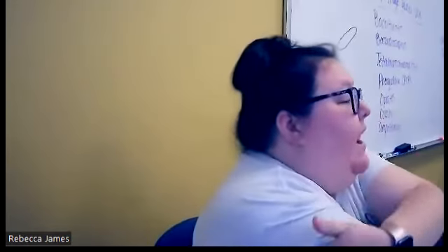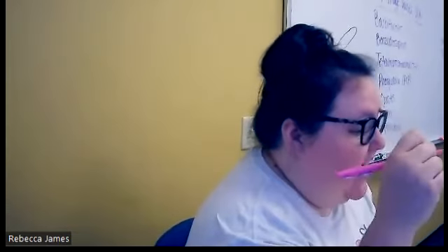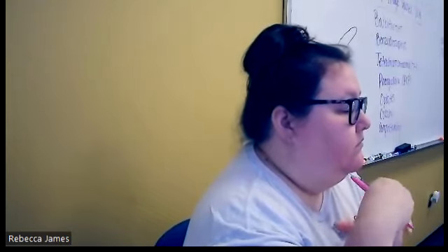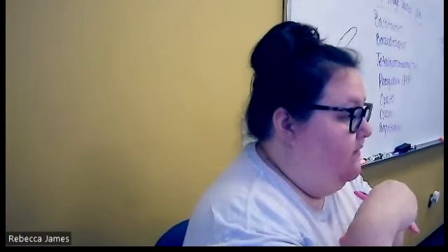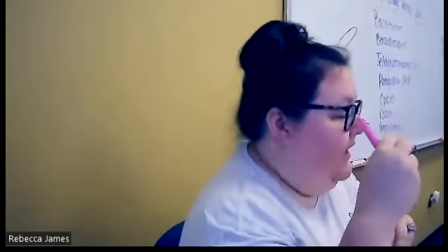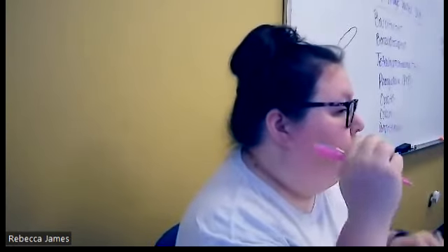They have those schizonts, and you see they're much larger, forming a band on the outer edge. Y'all see that? Whereas Vivax was all inside. Y'all see the difference? Vivax was like schizonts throughout the whole thing. Malariae is just on the edge.